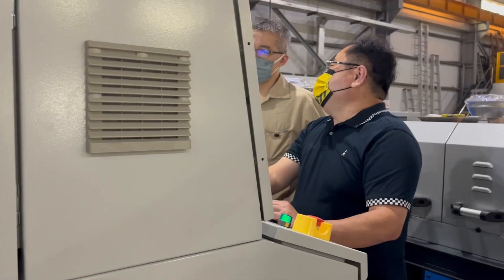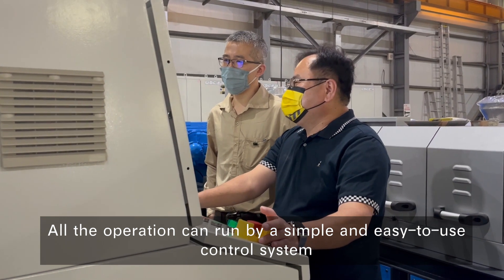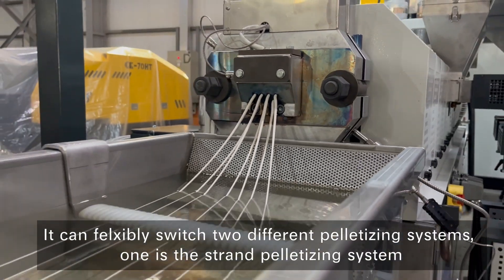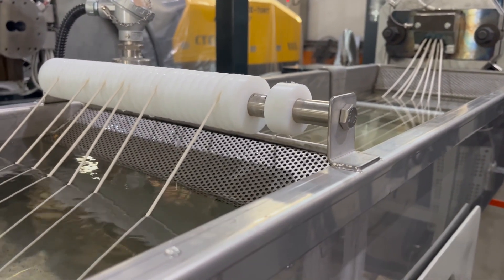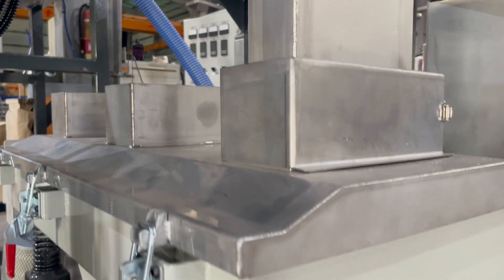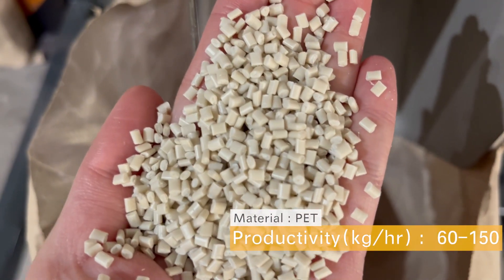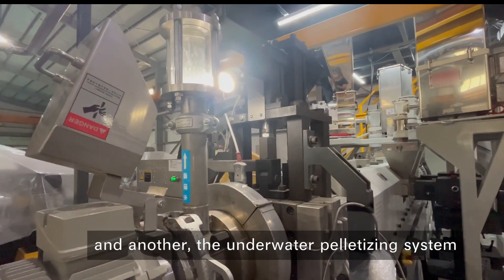All operations can run by a simple and easy-to-use control system. It can flexibly switch between two different pelletizing systems: one is the strand pelletizing system, and the other is the underwater pelletizing system.